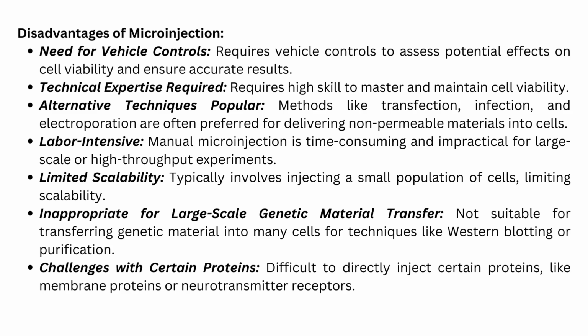Inappropriate for large-scale genetic material transfer, not suitable for transferring genetic material into many cells for techniques like Western blotting or purification. Challenges with certain proteins, difficult to directly inject certain proteins, like membrane proteins or neurotransmitter receptors.